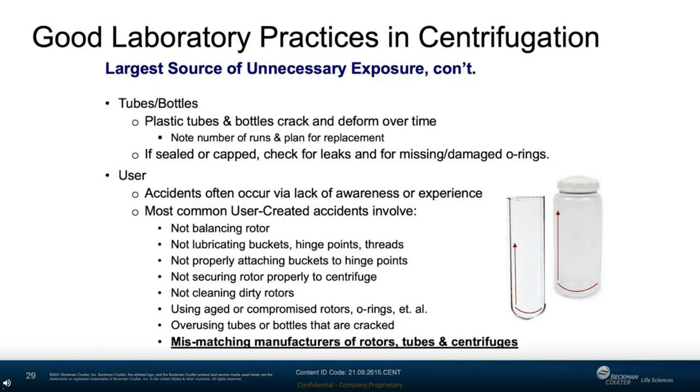Use manuals or manufacturer website or product support to learn good practice for rotor balancing, where regular lubrication is needed, how to clean and disinfect rotors. Rotor imbalance allowances can be as low, as Laurie has indicated, as 0.2 grams for some ultracentrifuge rotors and up to 10 grams for large volume high-speed rotors.